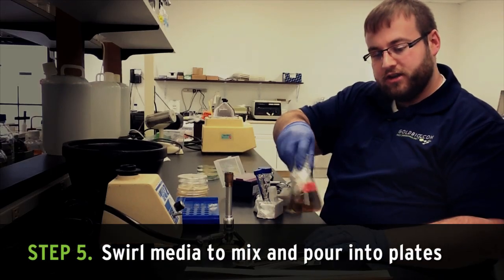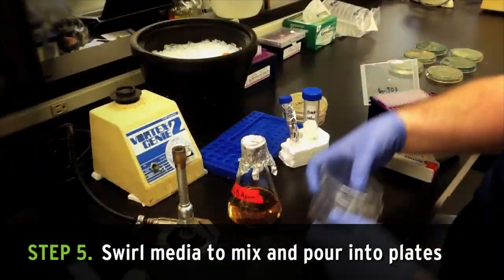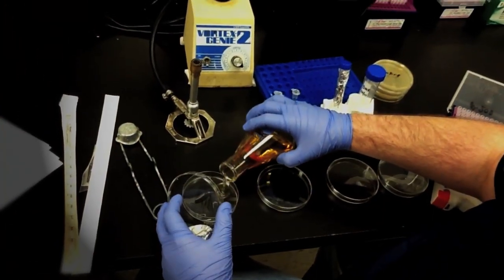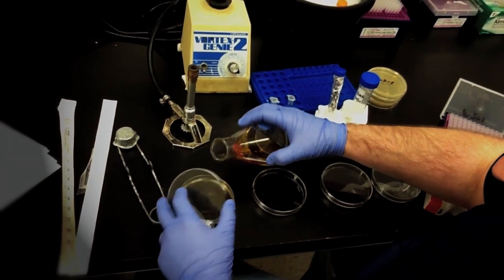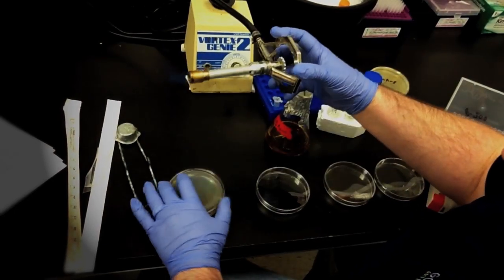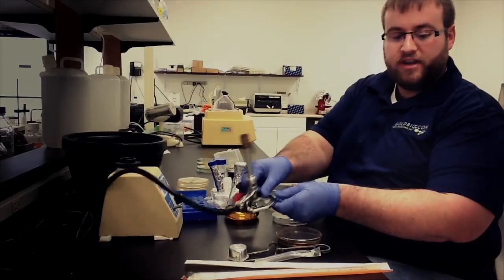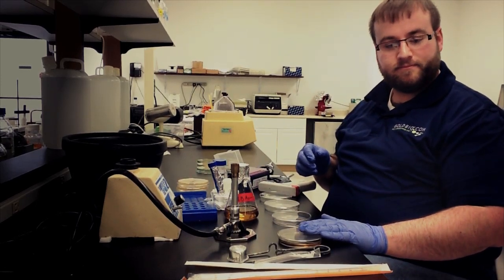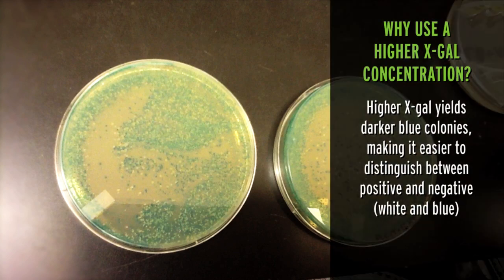Swirl to incorporate all the ingredients and pour the agar into your empty plates. You can flame the plates to remove any excess air bubbles. Then dry the plates open in a laminar flow hood or covered on the bench top. We recommend using a higher concentration of X-Gal than some other protocols because it gives the colonies a deeper blue color and significantly decreases the number of ambiguous colonies — ones that are kind of blue but not as blue as the others.